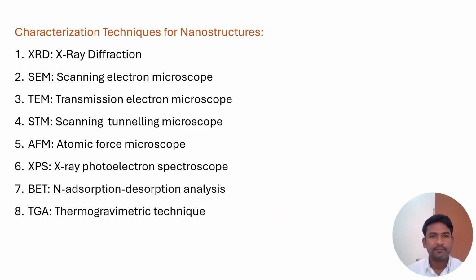Here the list of techniques are displayed to characterize the nanostructures. The first, the most important one is X-ray diffraction technique. The second one is scanning electron microscope and transmission electron microscope and scanning tunneling microscope, atomic force microscope.